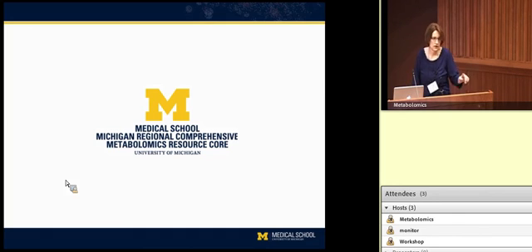Okay, go ahead. How many internal standards do you use in a study, and how do you choose your internal standard? If possible, one per compound. If we can get them for some of the assays, we'll have one for each compound. Others we have one for every couple of compounds, and that would not necessarily be absolute quantitation as it's been discussed, but it's the nearest neighbor.